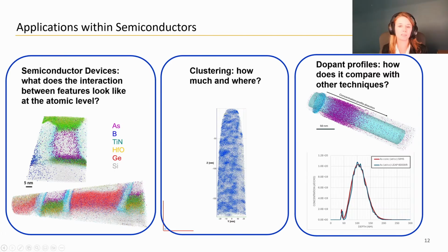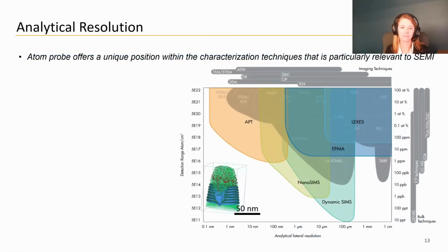Atom Probe really works best with samples that are solid materials, so not voided, and at least a little bit conductive. So typical applications are metallurgy, semiconductors, geology, and not too many applications at this point in time in the biological sciences. We can take a quick look at how Atom Probe Tomography compares to some other typical materials analysis techniques used by the semiconductor industry.